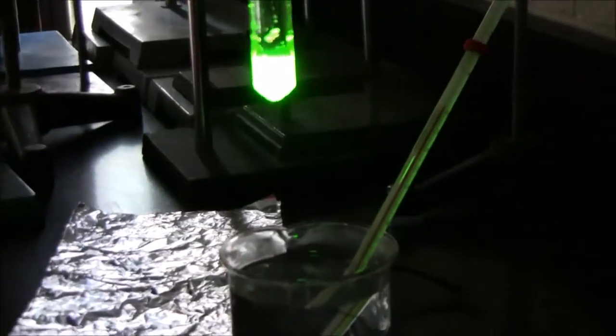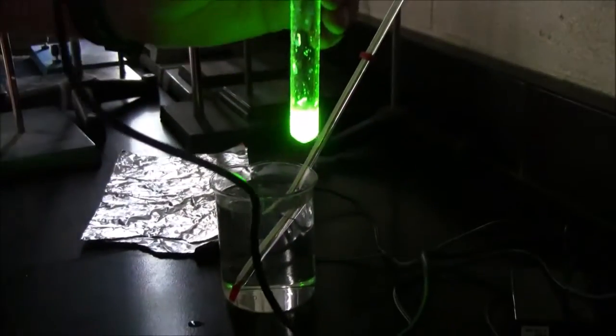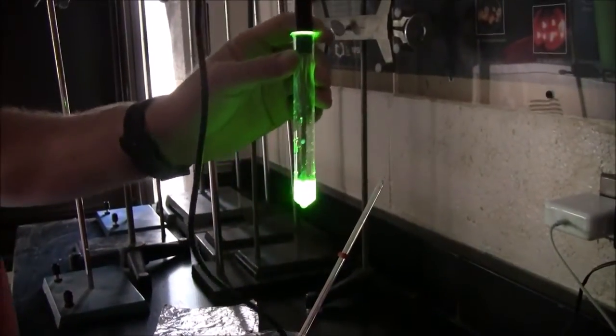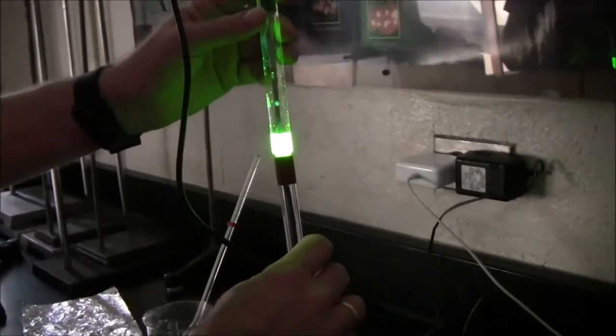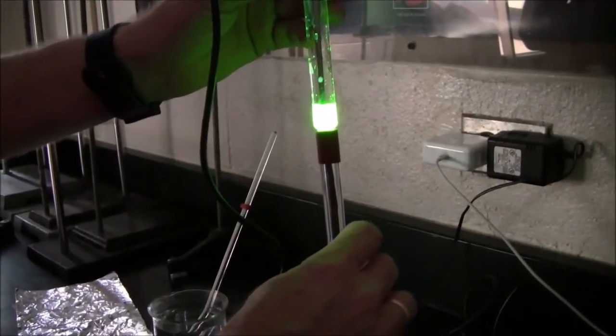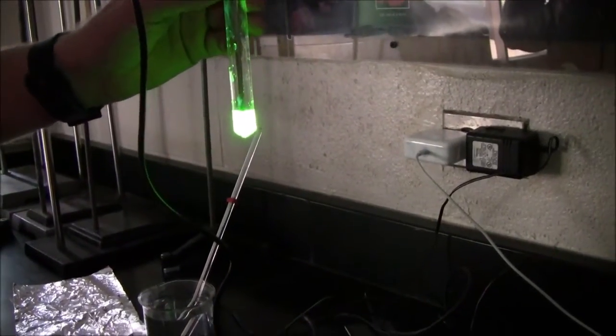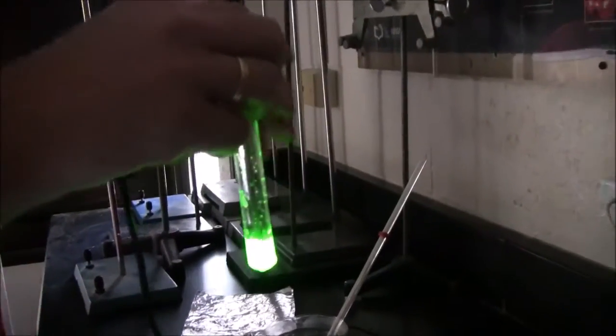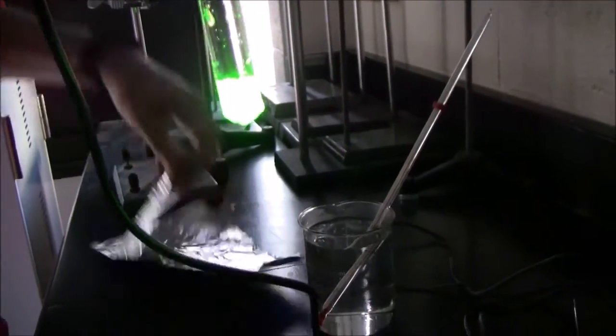So what I want to do now is I want to measure the temperature of the solution and measure how much light is coming off with the light probe. But obviously there's light in the room. So in order to just have light from the glow stick into the probe and not the ambient light, I'm going to try and wrap it up in tin foil.